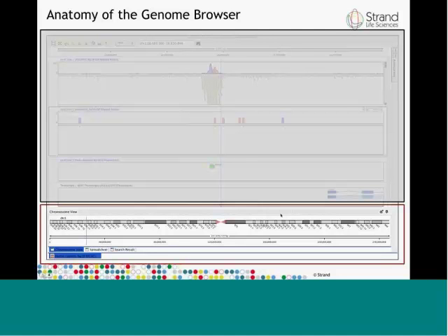If you take a careful look at this chromosome view, there are two small buttons at the top right corner. There is a title bar, and there is a tab which says chromosome view. It is possible to rearrange this sidebar and the various other sidebars by using these buttons and by dragging and dropping the title bar or the tab view.